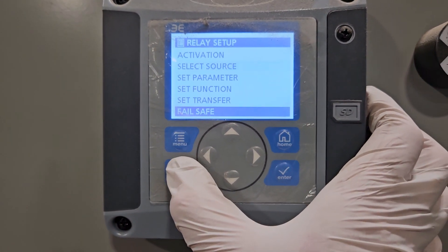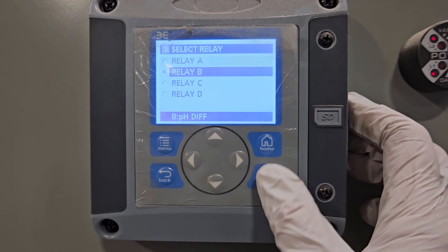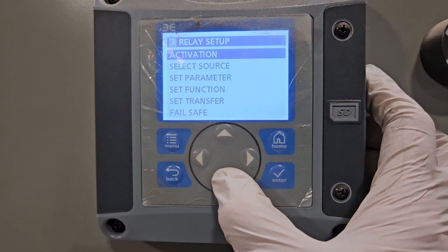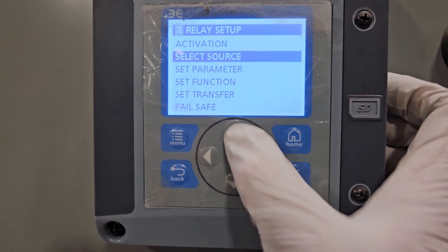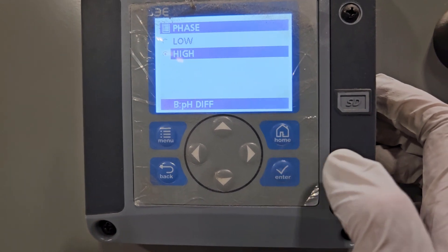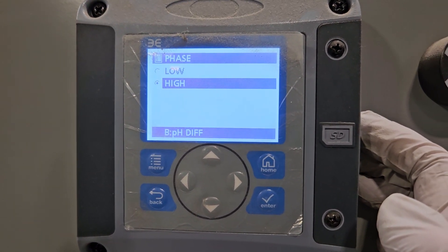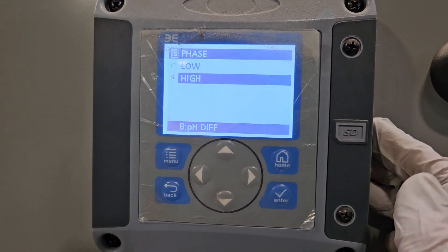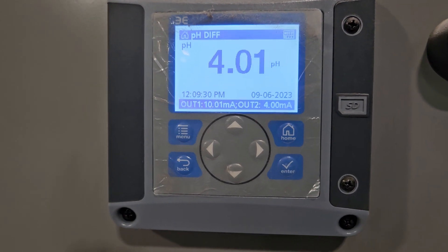The only difference is if we go back to Relay B — that's for a coagulant addition via pH; it's an acidic coagulant. Looking at the activation, the only difference is that the phase is going to be reversed compared to the caustic, alkaline, or lime type solution. When adding an acidic product, the phase should be set to high. Other than that, everything else is the same.